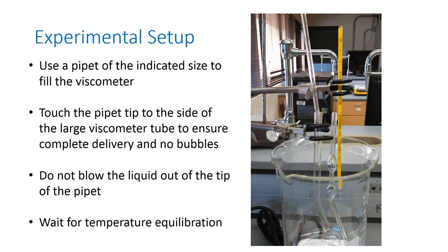So you're going to use a pipette to fill the viscometer through the bigger of the two tubes. You're going to want to touch the pipette to the side of the tube and let the liquid flow down very gently into the viscometer. The reason to do this is because we don't want any bubbles. The polymer solutions you're going to use are very good foam stabilizers, so they will form bubbles and the bubbles will not go away.